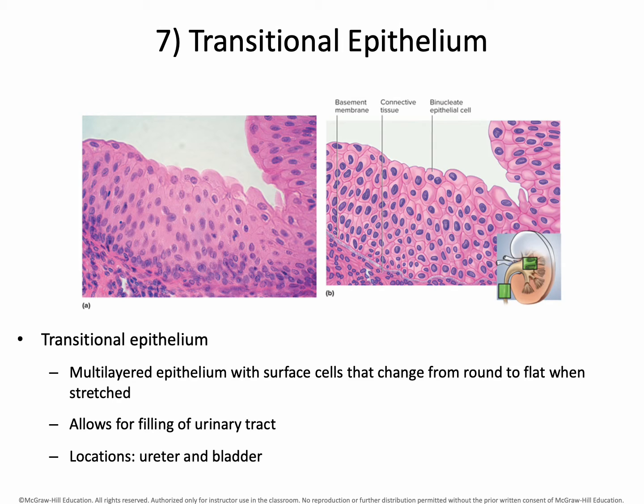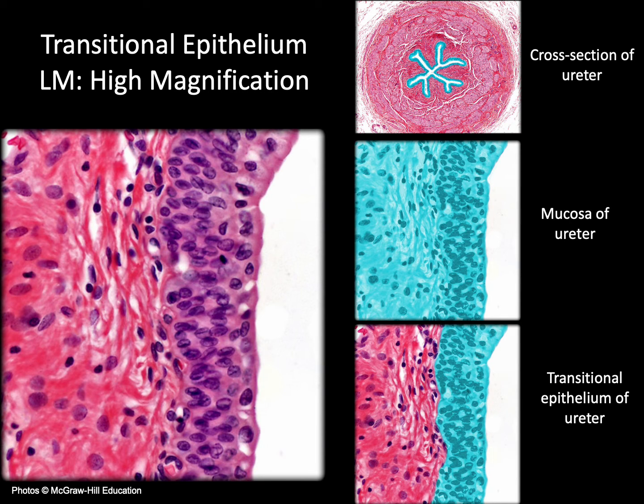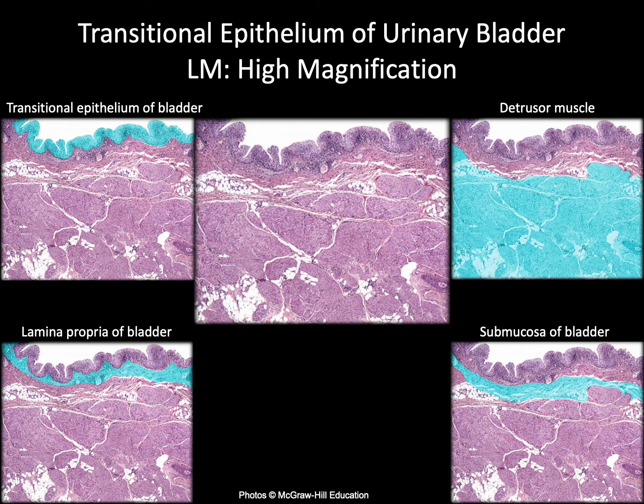Transitional epithelia you see in the urinary tract, and it is kind of nondescript in a way. It looks like a bunch of simple stratified cuboid cells, but it stretches, and you don't typically see it in slides under tension, but if these cells were to be stretched, they would thin out and change shape as they stretch. But transitional epithelia, again, you always see associated with the urinary tract, areas where the epithelial layer has to stretch a little bit in order to accommodate an influx of fluid.